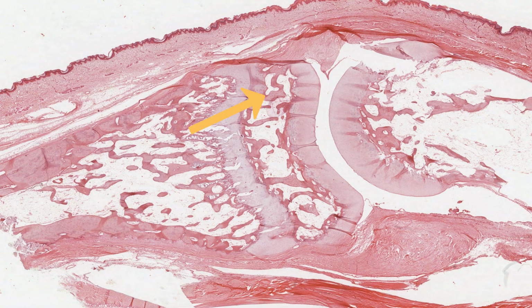This bone here shows both a primary and a secondary ossification centre, separated by an epiphyseal plate of pale bluish hyaline cartilage. The other bone over here is more advanced in its development. The epiphyseal plate has disappeared, and the two ossification centres have fused. It's even impossible to say exactly where the plate had been, because the primary and the secondary ossification centres have fused completely into a single marrow cavity.